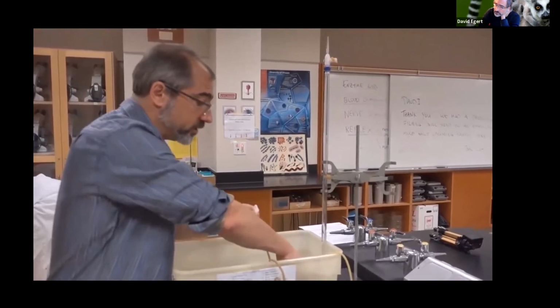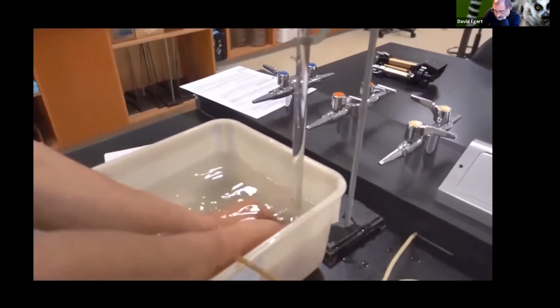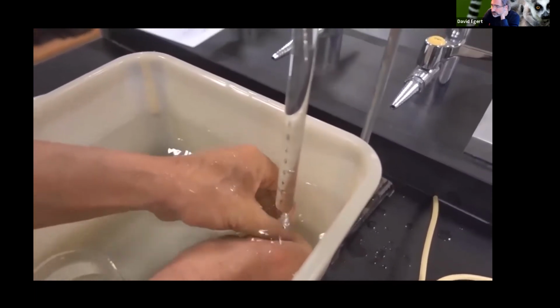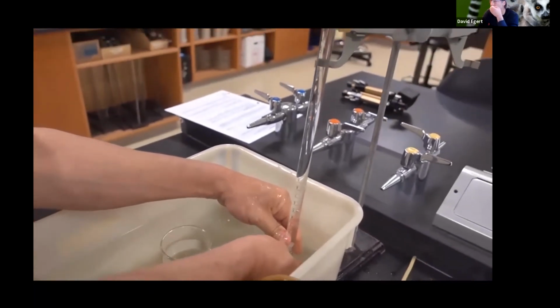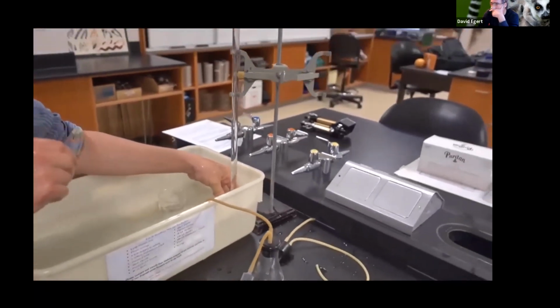So I'm going to basically reach under here and put it here. I want to make sure it goes far enough up that it doesn't fall out as we do the actual experiment. And so what we're going to do in a few moments is show you the actual experiment in progress. Okay.